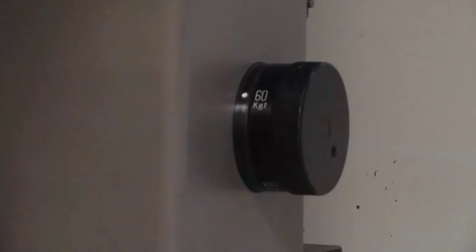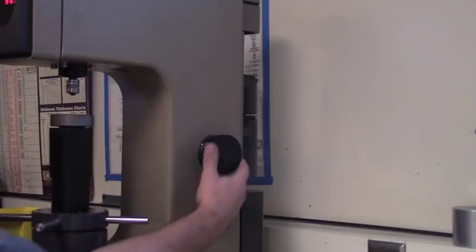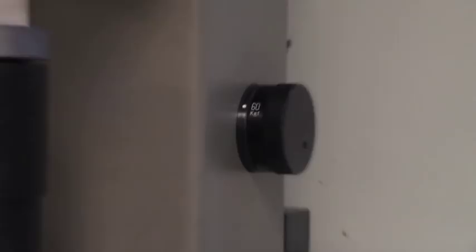A dial on the right side of the machine will change the load. This load should match whatever scale you selected. For R, 60 kg is appropriate.